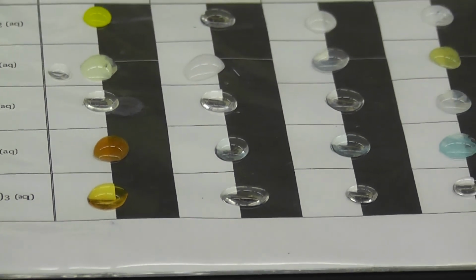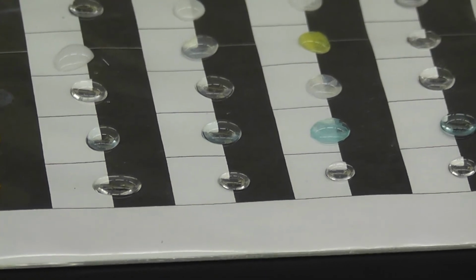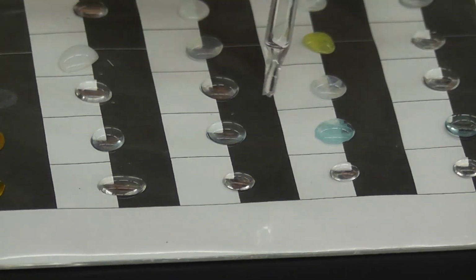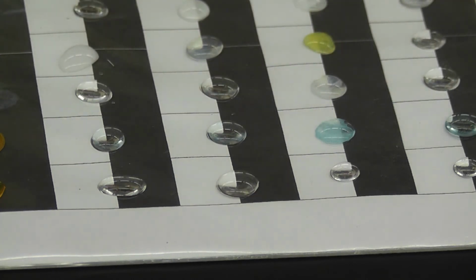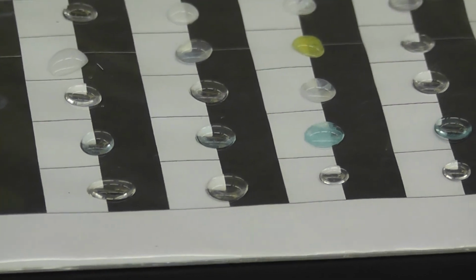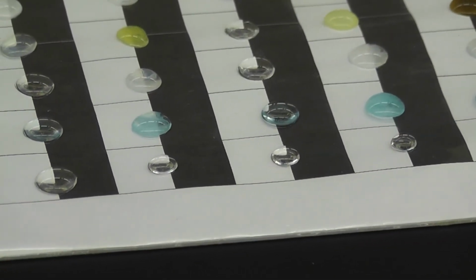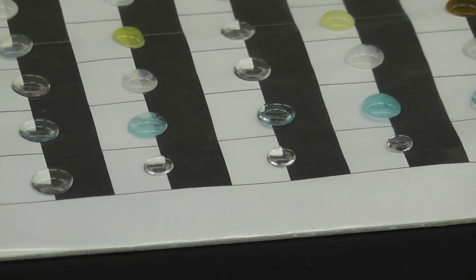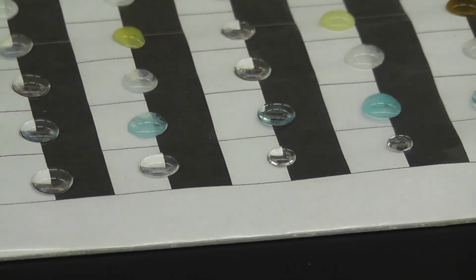Okay, next is the sodium sulfate. So I'm going to add a drop of sodium sulfate to the iron 3 nitrate. Okay. Next is sodium phosphate. So I'm going to add 1 drop of sodium phosphate to the iron 3 nitrate. Here's that drop of sodium phosphate. Okay.